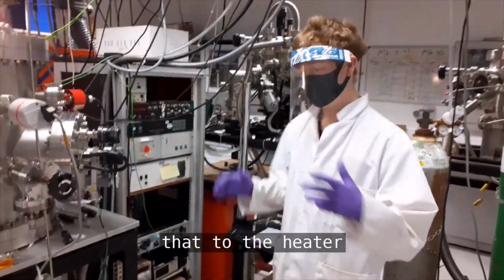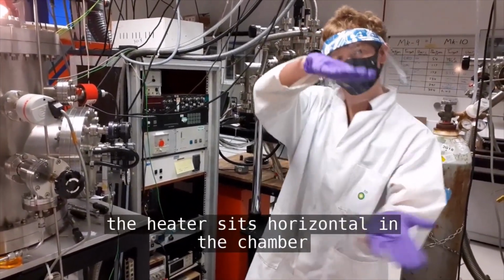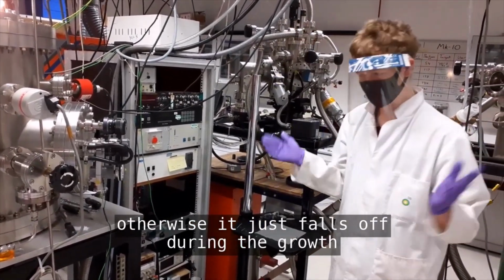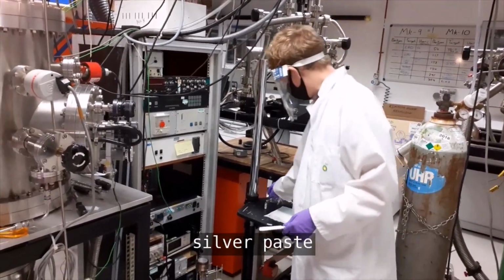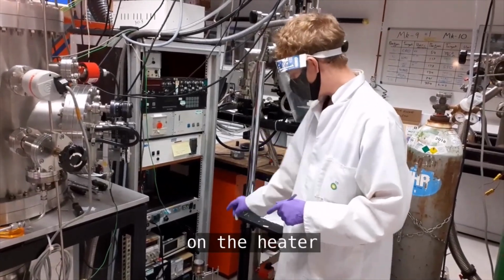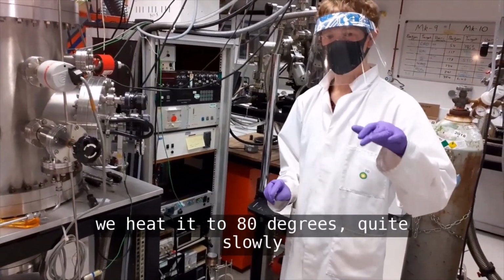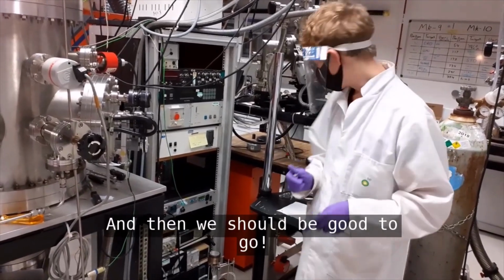I now need to stick that to the heater, ready to be loaded in. The heater sits horizontal in the chamber, so it needs to be quite well stuck, otherwise it falls off during the growth and you've just wasted several hours. So the way we stick it is with silver paste, and we just put a little dot on the heater, put the substrate on there, and then we heat it to 80 degrees quite slowly in order to set the silver paste, and then we should be good to go.